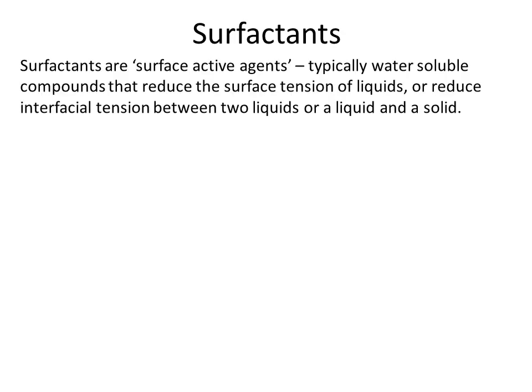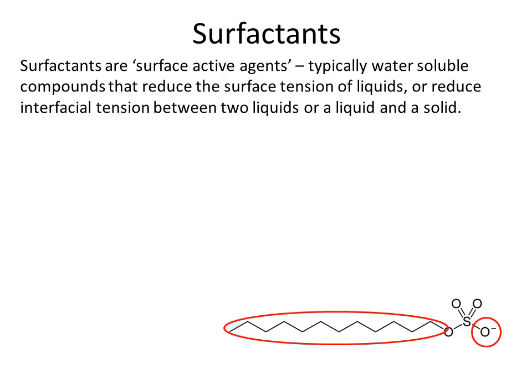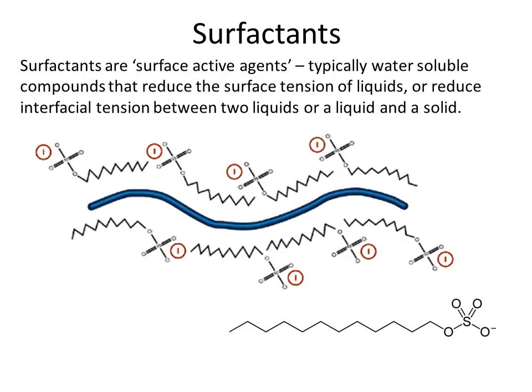The next group of additives that we are going to look at are the surfactants, or surface active agents, and these are similar to the detergents that you would use in dish or clothes washing. These molecules have one end that can be ionized to interact with water, and another part that's hydrophobic that can interact with the hydrophobic regions of proteins. When surfactants bind to a protein molecule, they can often disrupt or open up and denature its structure, unfolding regions of the protein and disrupting protein complexes.